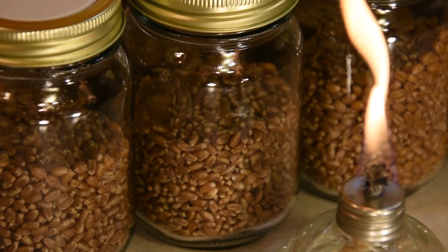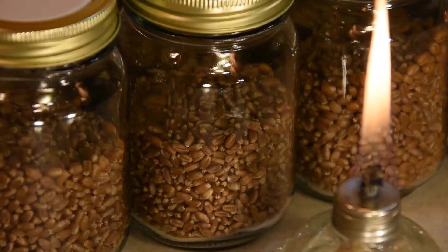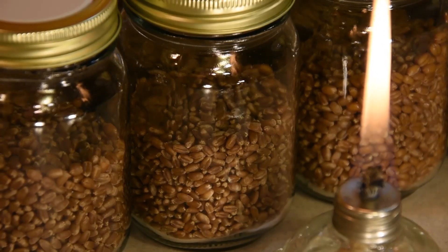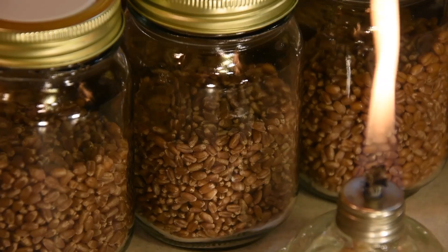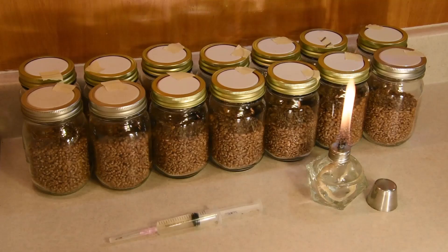We're starting with pre-hydrated wheat grain in pint jars that have been sterilized in the pressure cooker for 30 minutes. I'm using the lids that come with the jars, but taking the medallion piece and putting it upside down so that they won't create a seal in the pressure cooker and will allow some air exchange. I'm also putting a small piece of tape connecting the ring with the medallion so that they don't fall apart while I'm doing the transfer.